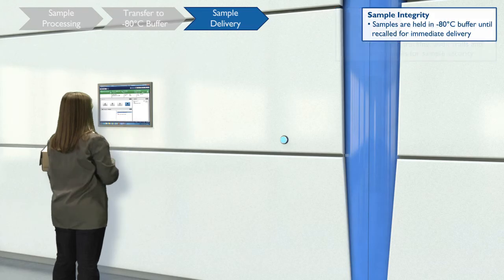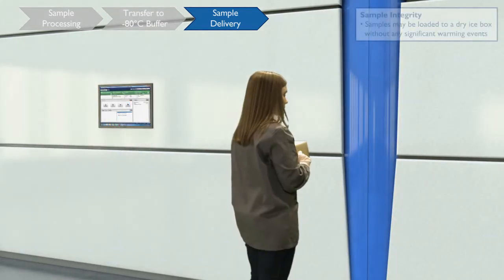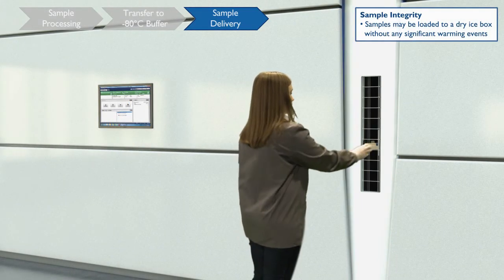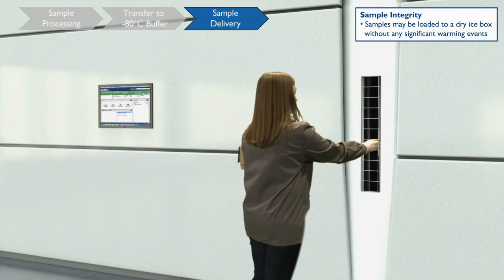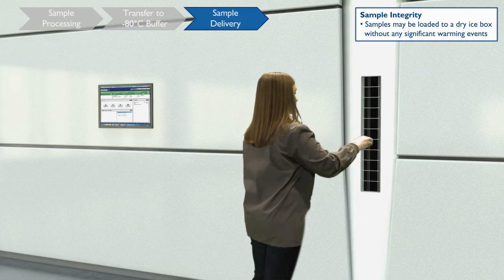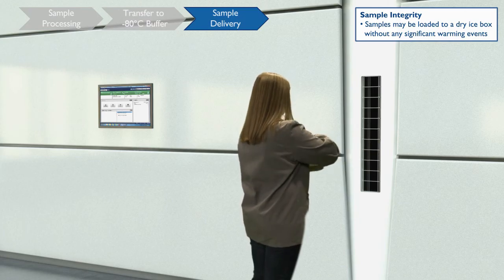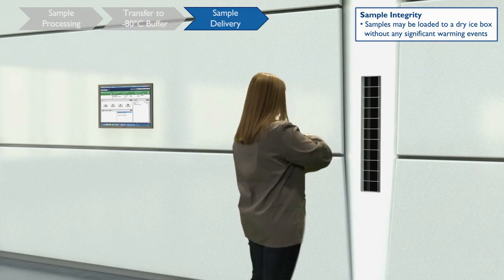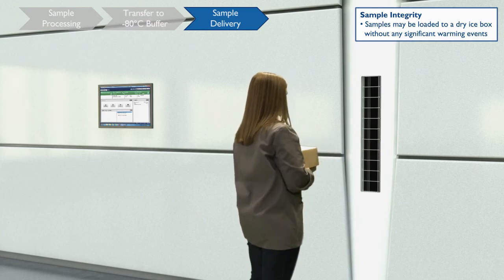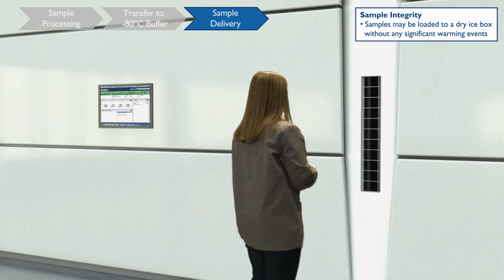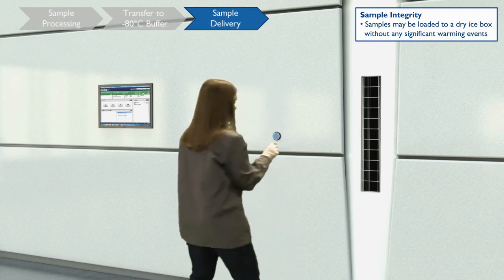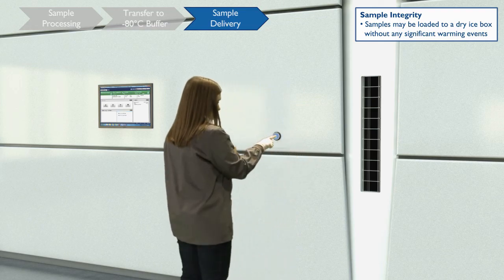BIOS then automatically retrieves your samples from the buffer and places them into the input-output station for removal. Your cold samples can be loaded directly onto dry ice for immediate transport.